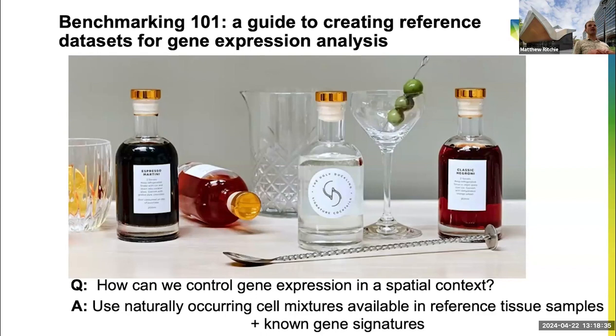But of course, a lot of people have go-to reference samples where they have really studied the anatomy, what sort of features should be there, what sort of cells should be where, and we can use that biological ground truth. Another thing one can do is just vary the types of tissue. For example, if you get healthy tissue from a male sample and from a female sample, then the only things that will change might be sex-specific genes. And similarly, if you knock out a gene and you've got your control, there are particular perturbations you do to samples that you can try and use. And again, will the spatial technology read that back to us or not? So that's what we'll be doing today.